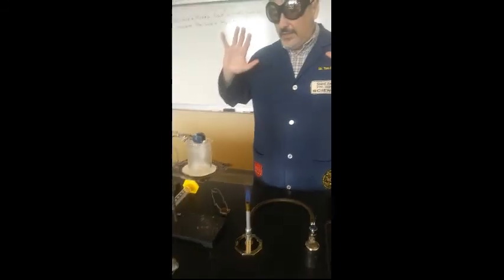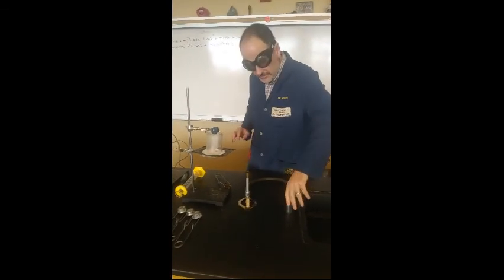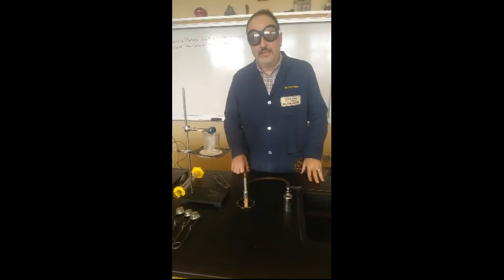So then you put it over there, you cook it, you do your lab, and when you're all done, you turn it off at the source all the way. And that's how you light a lab burner.